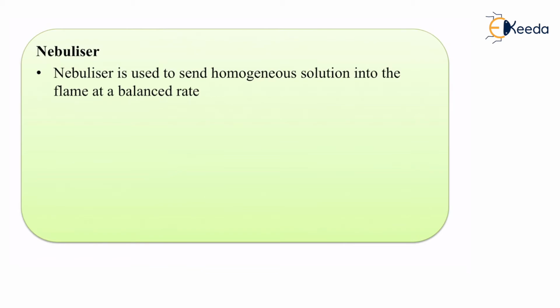When we do this, the flame remains at a constant temperature, and this mechanism happens with the help of the nebulizer.